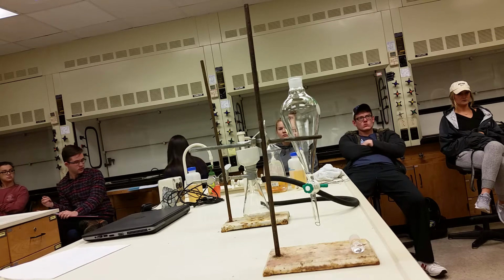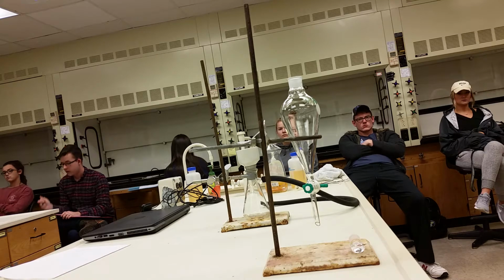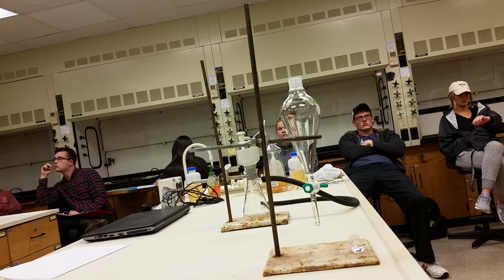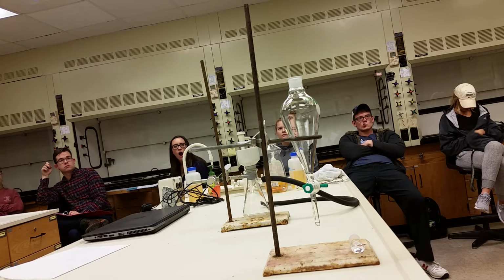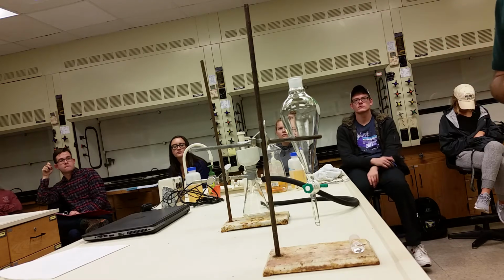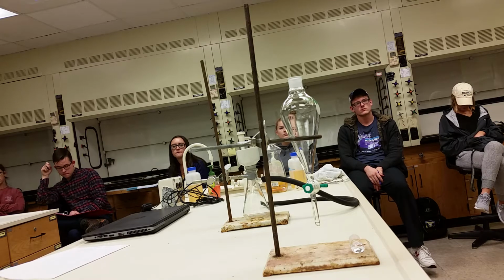So what you're going to do is an extraction. Extraction is a way of moving one compound from one solvent to another. We're going to do that by changing the solubility of our compounds using acid-base chemistry. So you're going to come in next week and there's going to be an unknown. You're going to have unknowns 1 through 12. You're going to pick one of those, write down the unknown number, and weigh out 1 gram of that.